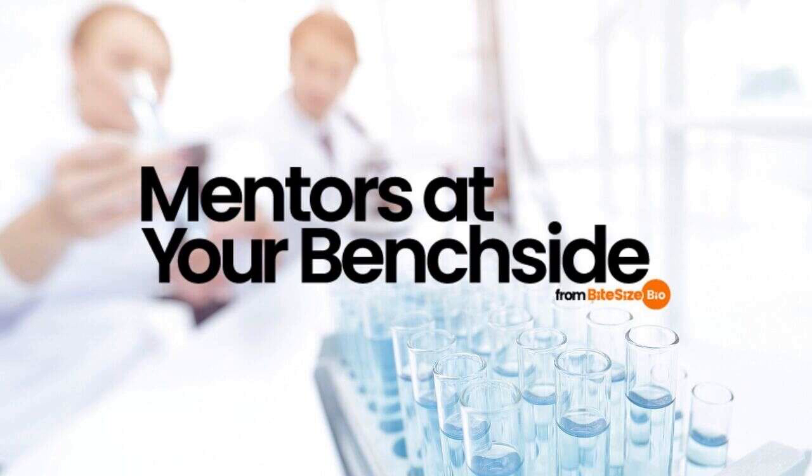Number 4, isotype control. This is incubation of the sample with a non-immune antibody of the same isotype, for example IgG1, IgG2A and IgM, and make sure you perform this incubation at the same concentration and conditions as your primary antibody. This control checks that non-specific interactions of the primary antibody do not cause the observed staining. Any background staining you observe with this control should be minimal and distinct from your specific staining. This control is useful when working with monoclonal primary antibodies.